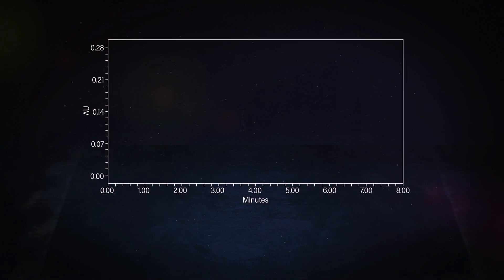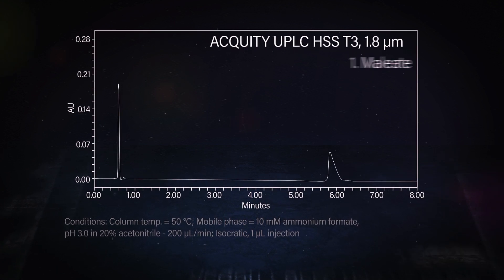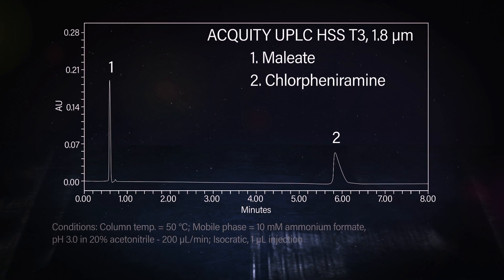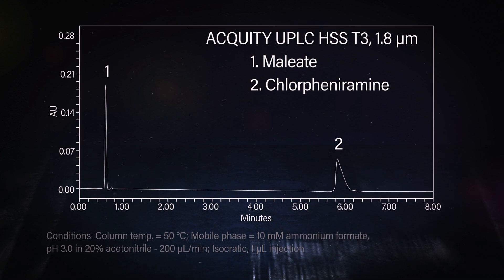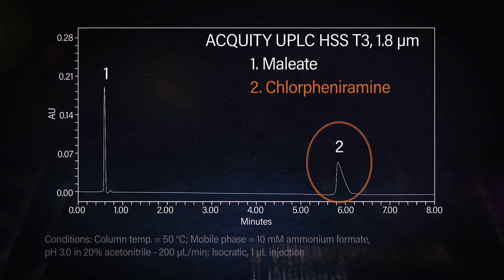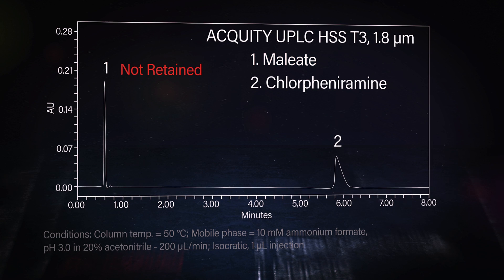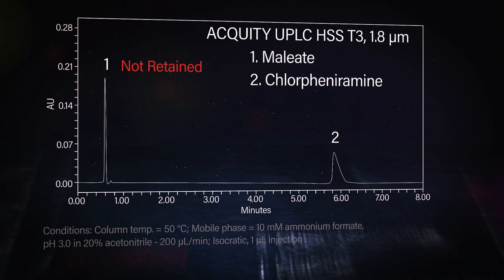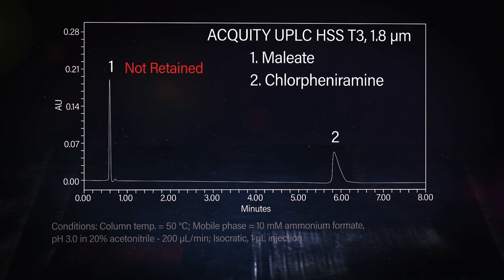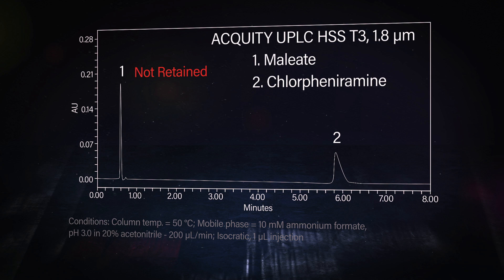It's always cool to run experiments especially for polars, which are typically challenging. When we look at the HSST3 column, we see very good retention for the chlorpheniramine, but essentially no retention at all for the polar acid maleate. We can expect this because the T3 chemistry is actually just a C18 bonding — it's standard reverse phase. That polar compound comes right out in the void, and I think this is what customers see when they try to analyze these types of analytes on a reverse phase column.